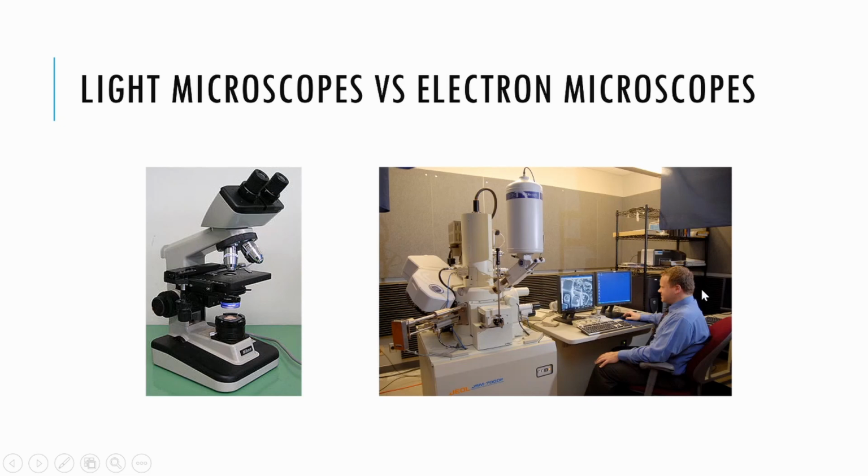An electron microscope is very different. Instead of using visible light, we're going to be shooting a beam of electrons at whatever it is we're trying to look at. And so you have a much larger piece of machinery involved for that process, and the images are seen on a computer instead.